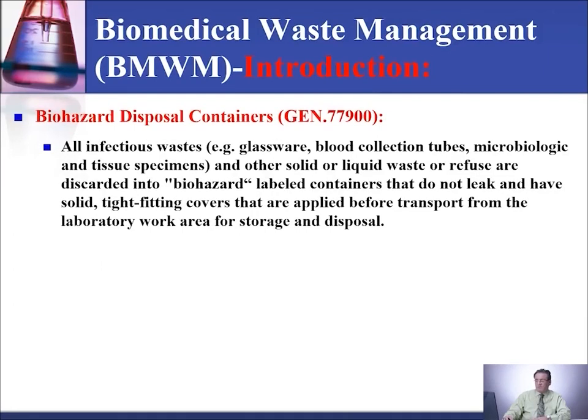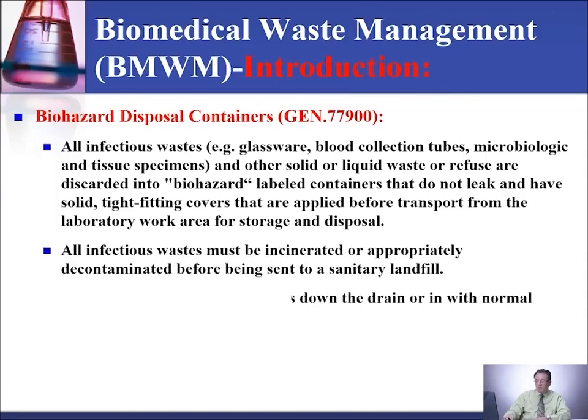The biohazard disposal containers, and you will find this in the LabGen 77900. All infectious waste and other solid or liquid waste or refuse are discarded into biohazard-labeled containers that do not leak and have solid, tight-fitting covers that are applied before transport from the laboratory work area for storage and disposal.